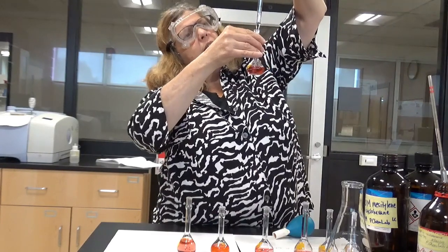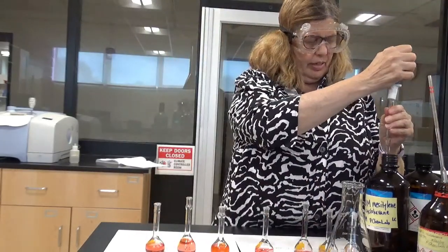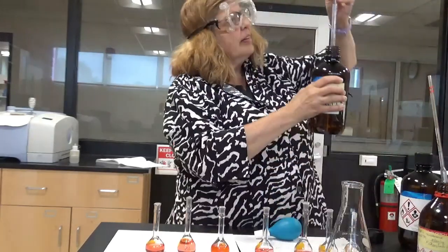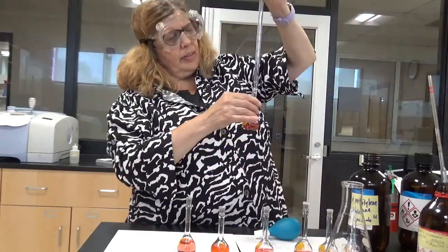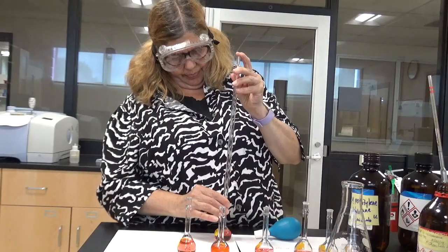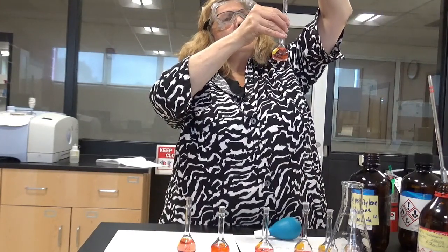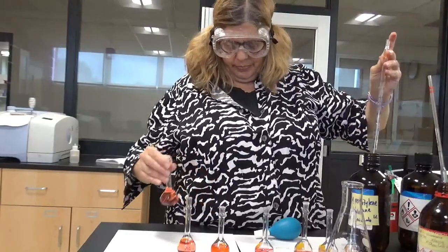Nine, 10 more and I'm done. Well, I have to bring everything to the mark with cyclohexane, and after that I'll be done. Seven, 8, 9, 10. Good. All right.